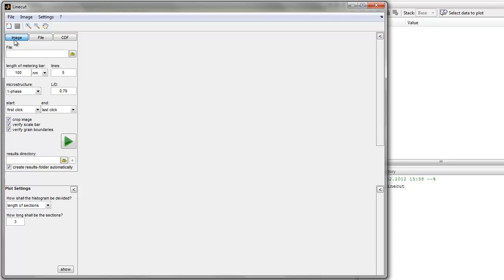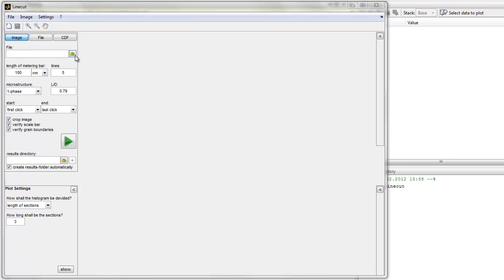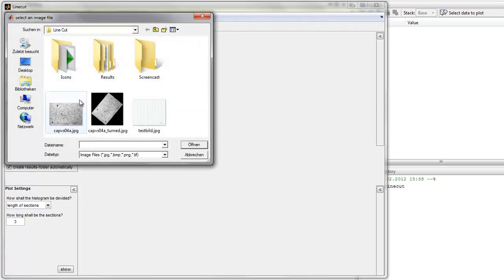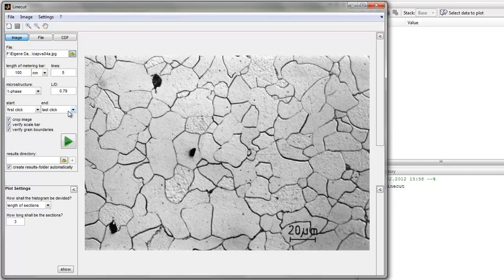Select image, then select the image file you want to analyze. It will be opened here. Then you have to choose all these settings.